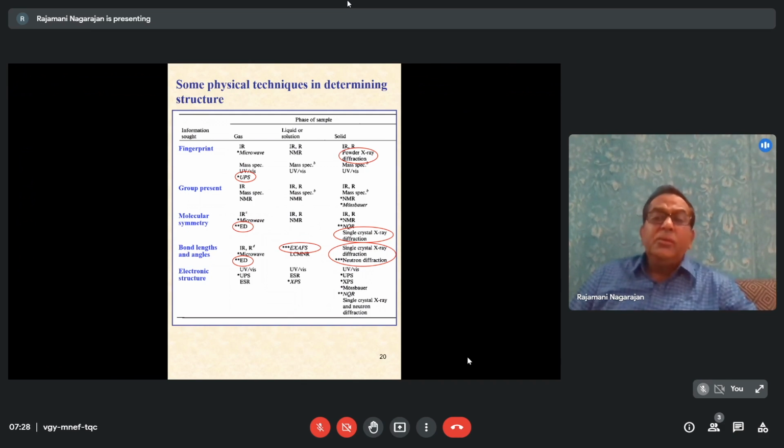But what is this nuclear quadrupole resonance technique? That means if you are having magnetic ions in your compound, and if you want to know whether these magnetic ions are in communication with each other, or how far they are placed. It is exactly like your NMR, but it is specific to a particular magnetic nucleus, and we are going to map that molecule and where these magnetic metal ions are going to be embedded in the structure. So that is the real purpose of doing nuclear quadrupole resonance.